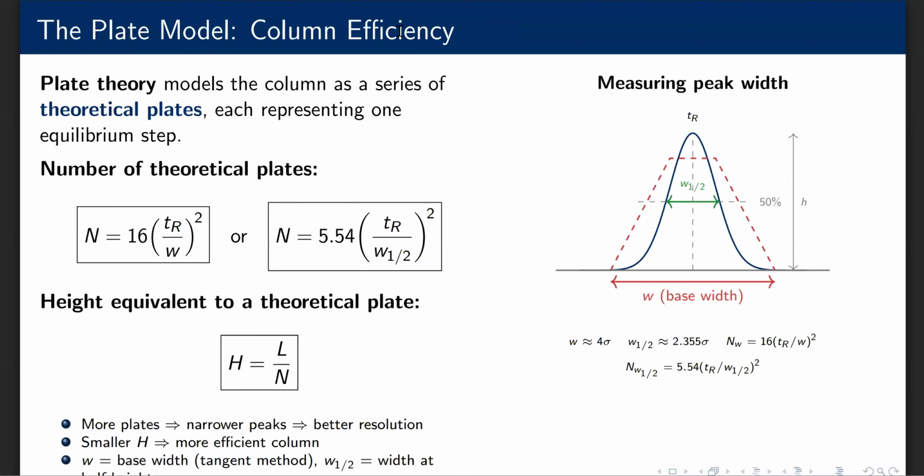Right, so moving on then. Now we're going to shift our focus. We've been asking, where does each peak appear? Now we're asking, how sharp are the peaks? And this is the domain of plate theory. Now have a look at the diagram on the right.